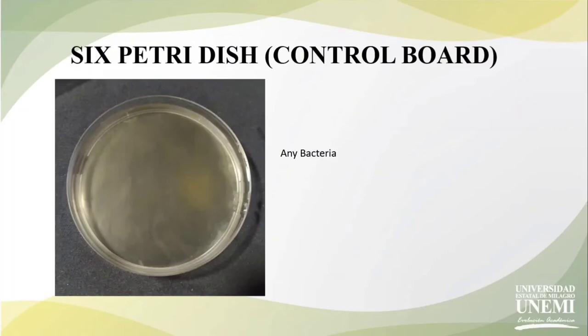Finally, we have our control plate where we did not inoculate any microorganism and we are finding it clean. This means that we have the correct agar. We can see the presence of Staphylococcus aureus in most of our samples, and they are very common in the domestic environment, as is E. coli.